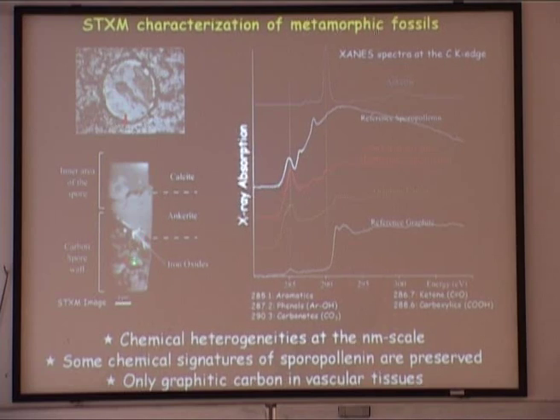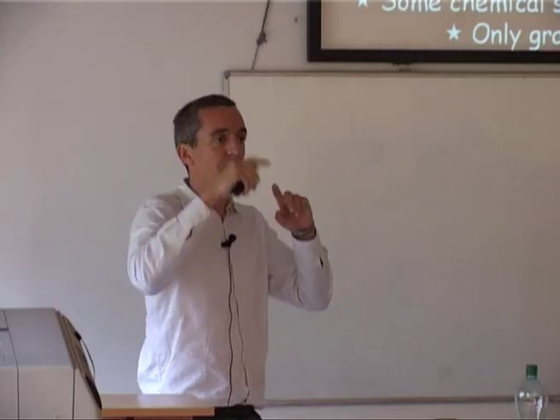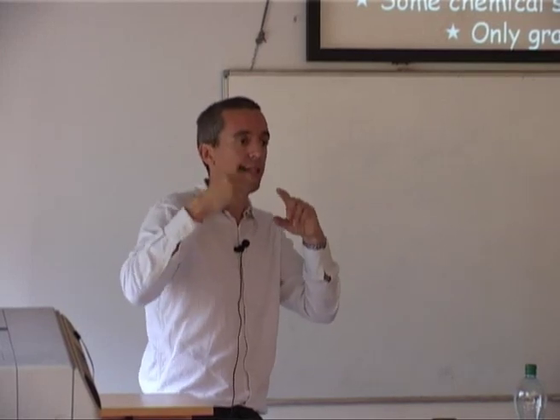If we look at the blue point, TEM tells us that this is carbonate. This is how it looks. We have this spectrum, and this spectrum is characteristic of carbonate. We know that this peak is characteristic of electron transition in carbonate groups.